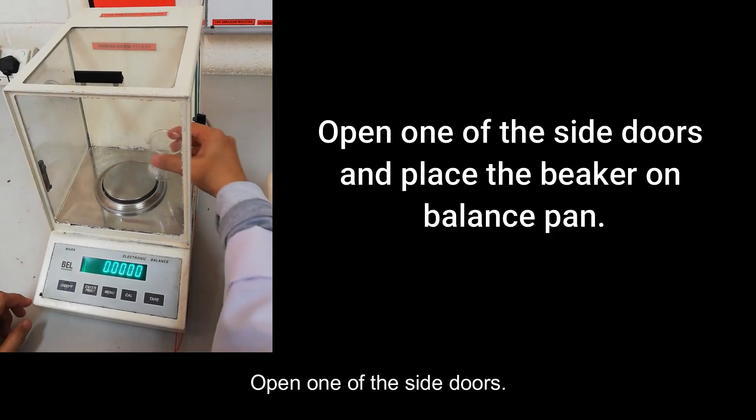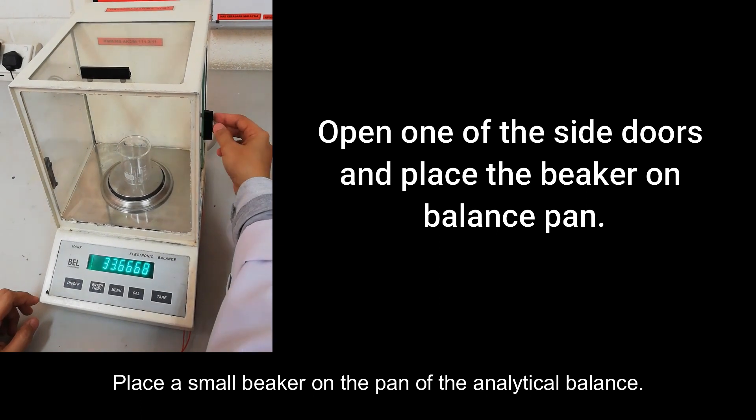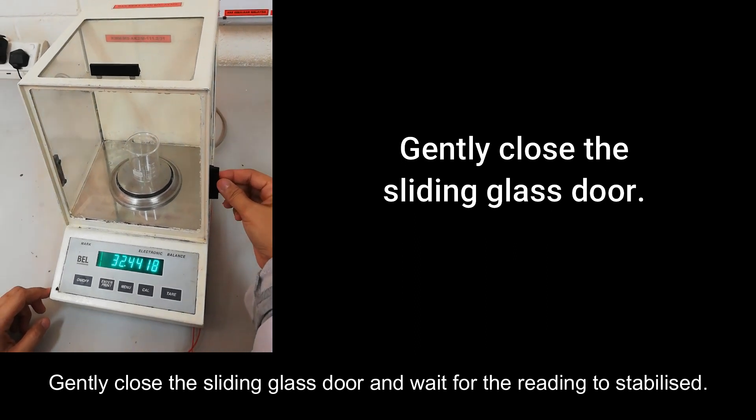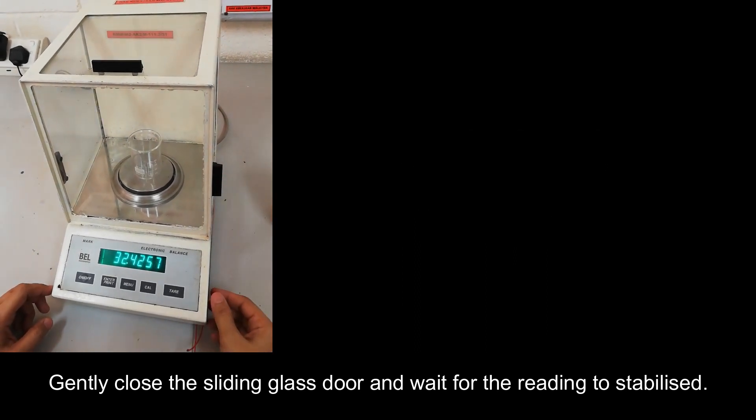Open one of the side doors. Place a small beaker on the pan of the analytical balance. Gently close the sliding glass door and wait for the reading to stabilize.